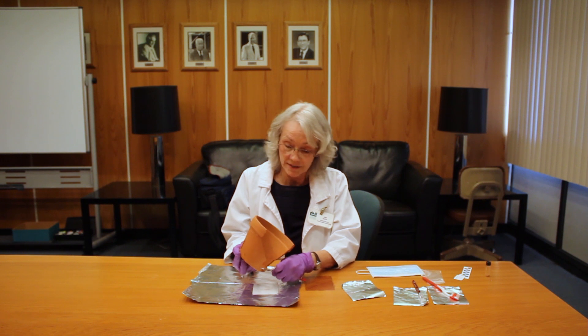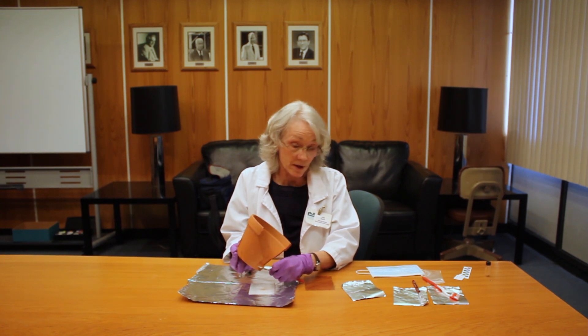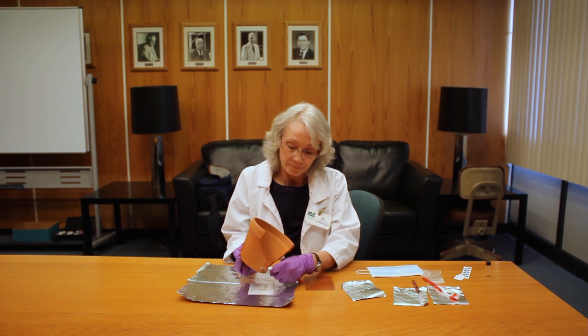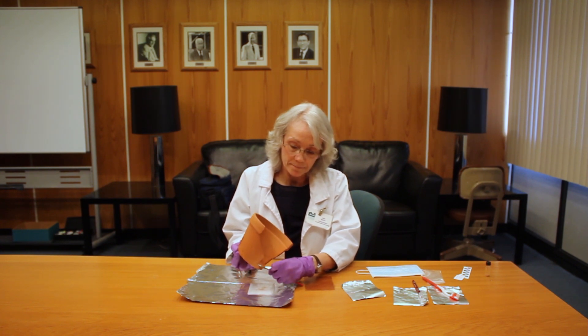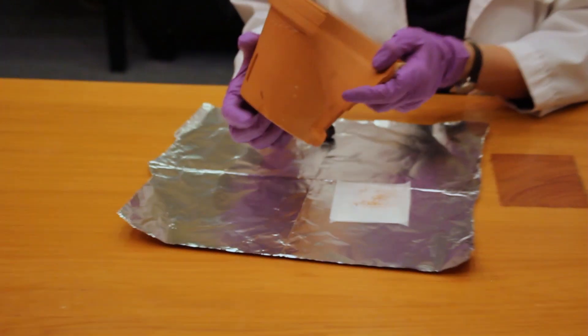If you were grinding your own coffee beans in the morning or standing in line at a Starbucks, make sure you're wearing a lab coat or something over your clothing, because that's another potential source of contamination.